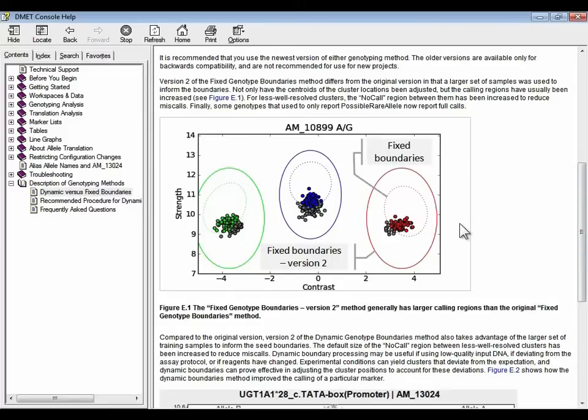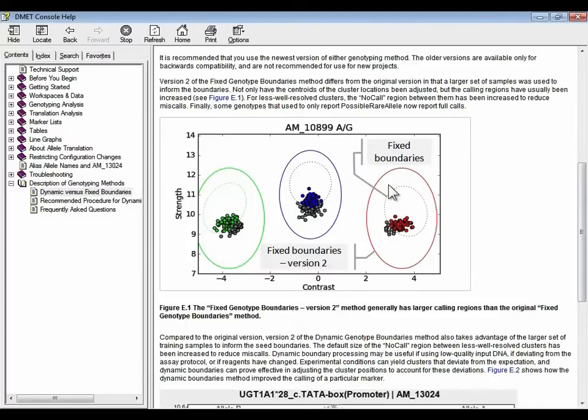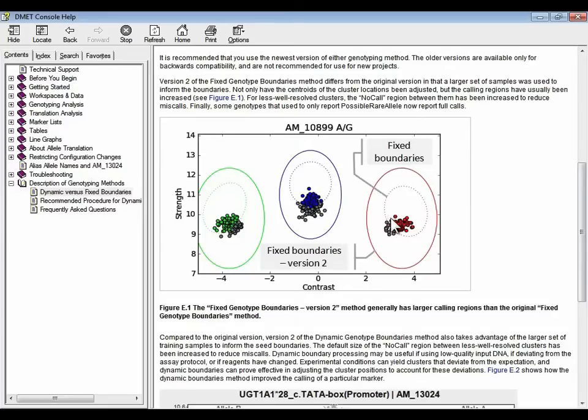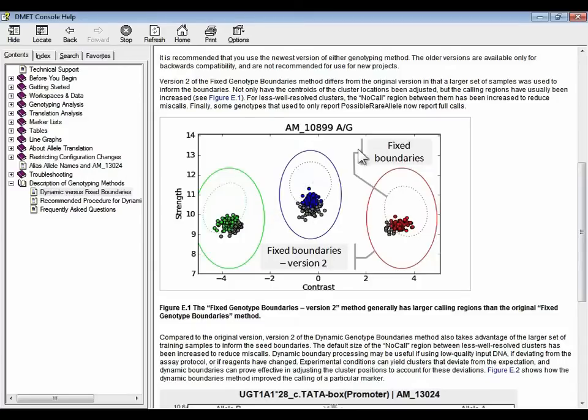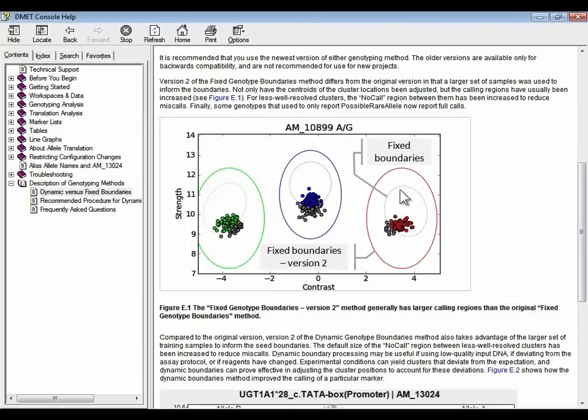So here we have a cluster plot for one particular marker that distinguishes between AA, AG, and GG genotypes for this marker in the three clusters. Each data point represents one sample or one chip file. And you can see that the ones that are color coded red, blue, or green are the ones that are fully called using the original fixed boundaries method. In the reference model file that's used, if a data point falls outside those hard boundaries, then it will be no called, which is these gray dots.